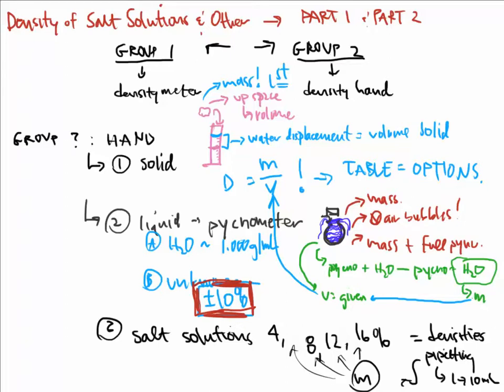So I got really excited in the last video and accidentally hit the stop button. And I left it off at the point where we would take these 4, 8, 12, and 16% salt solutions and start getting their density measurements by hand.